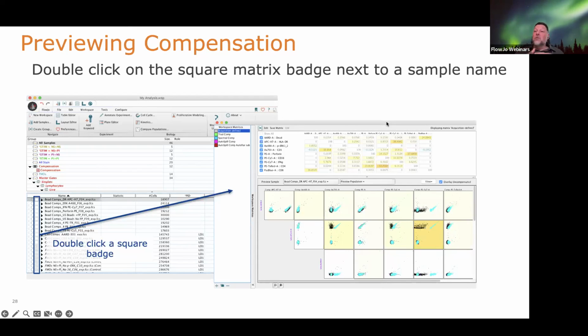You still want to always treat your comps like you treat your cells. And yes, if it's beads, in my lab, I would fix and perm the beads because I'm trying to treat the antibody fluorochrome conjugate. And if there's any breakdown of that tandem dye fluorochrome due to the harsh buffer system that I'm using, I want to recapitulate that even if it's on beads. So let me give you an example. Actually, I'm going to give you an example here.